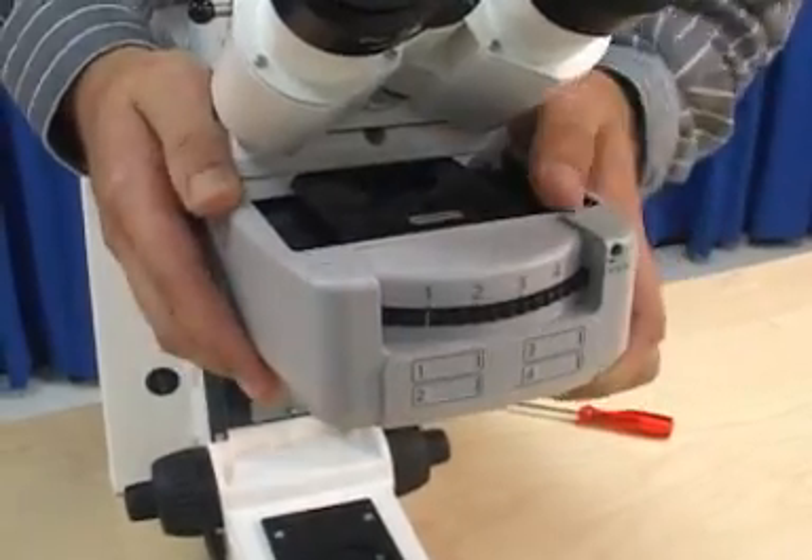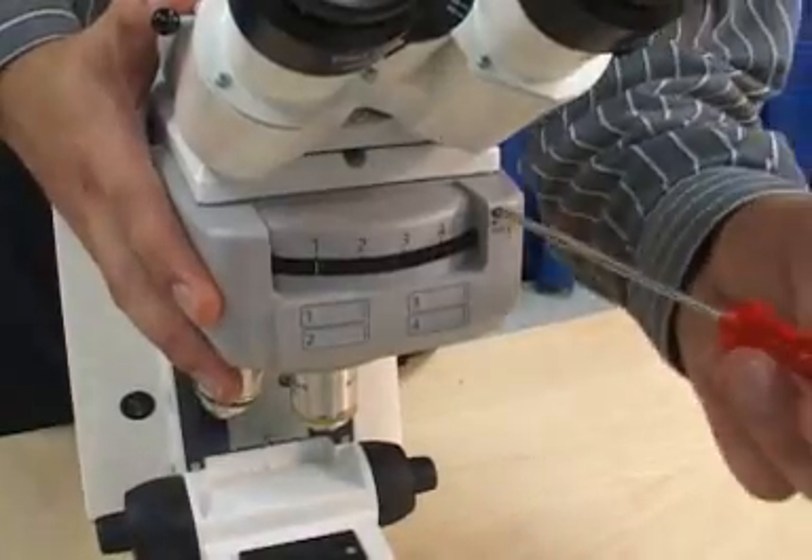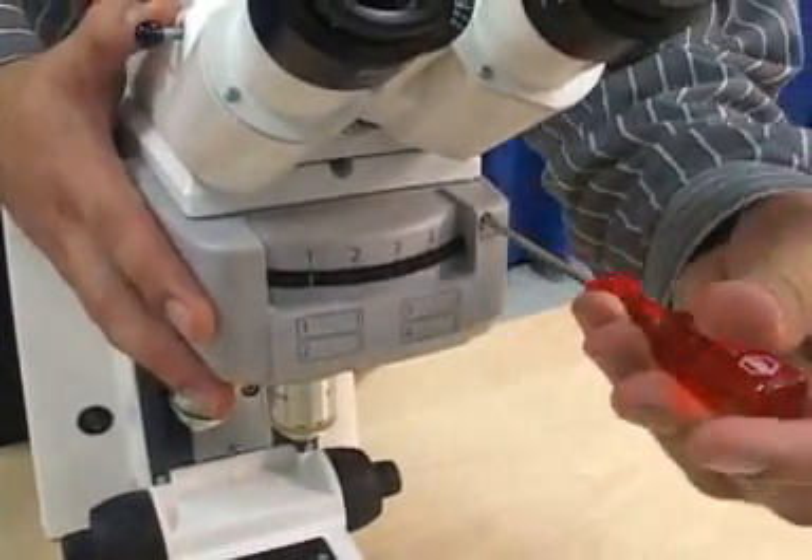Slide the reflector turret into the space above the nosepiece and turn the locking screw clockwise. It only needs a slight turn — be careful not to over-tighten.